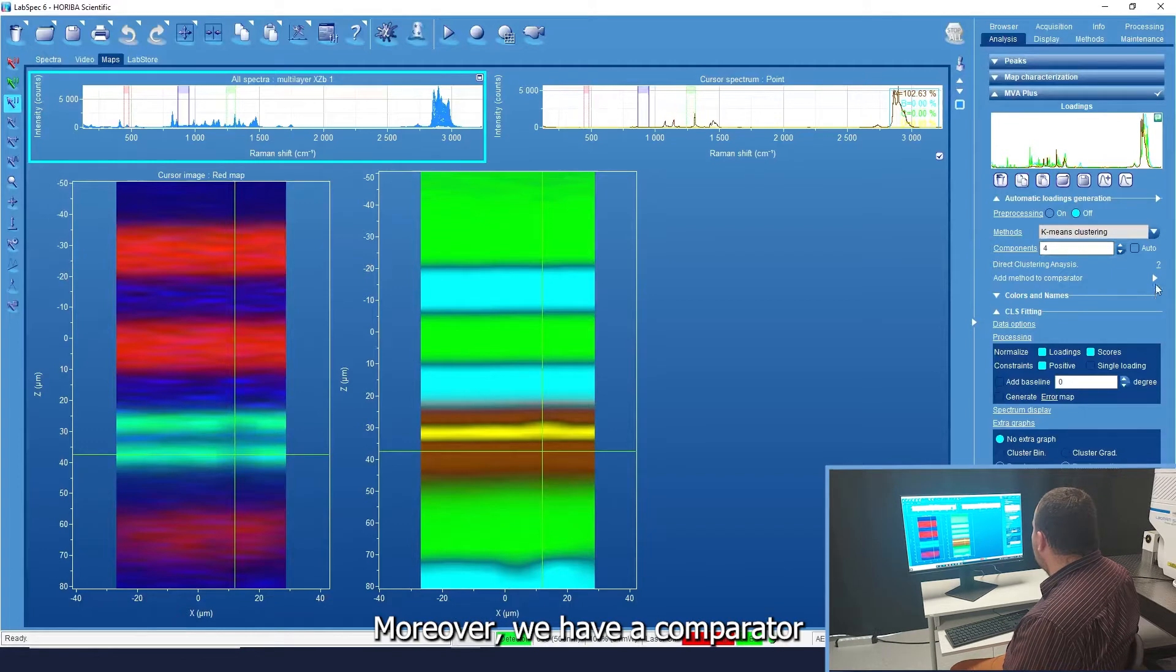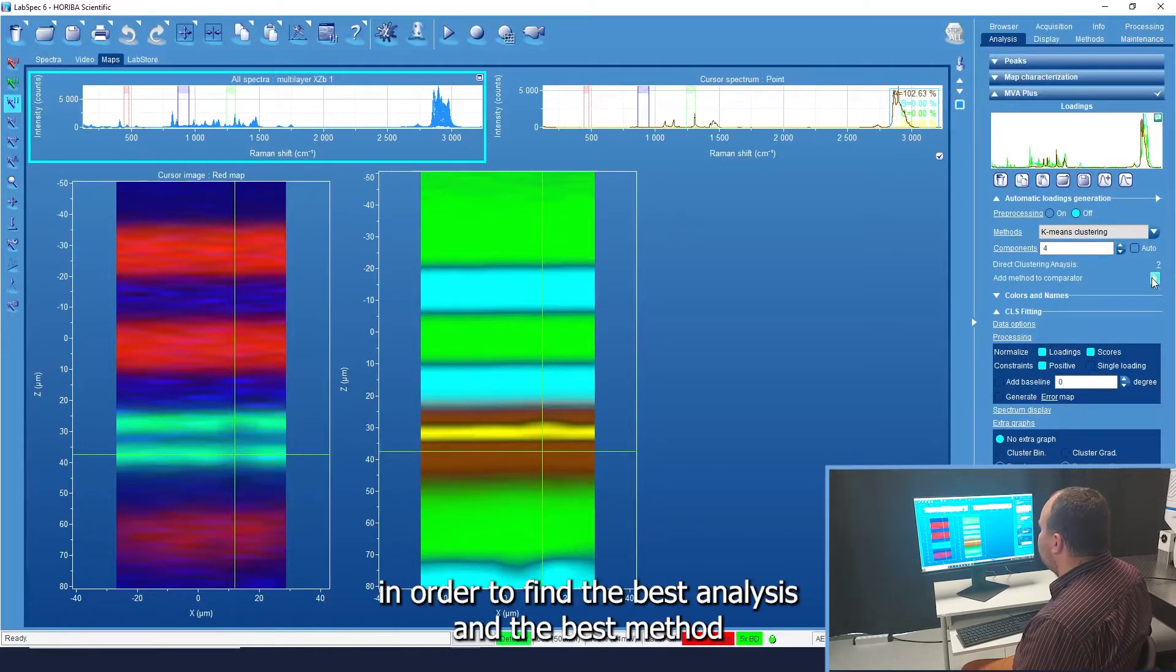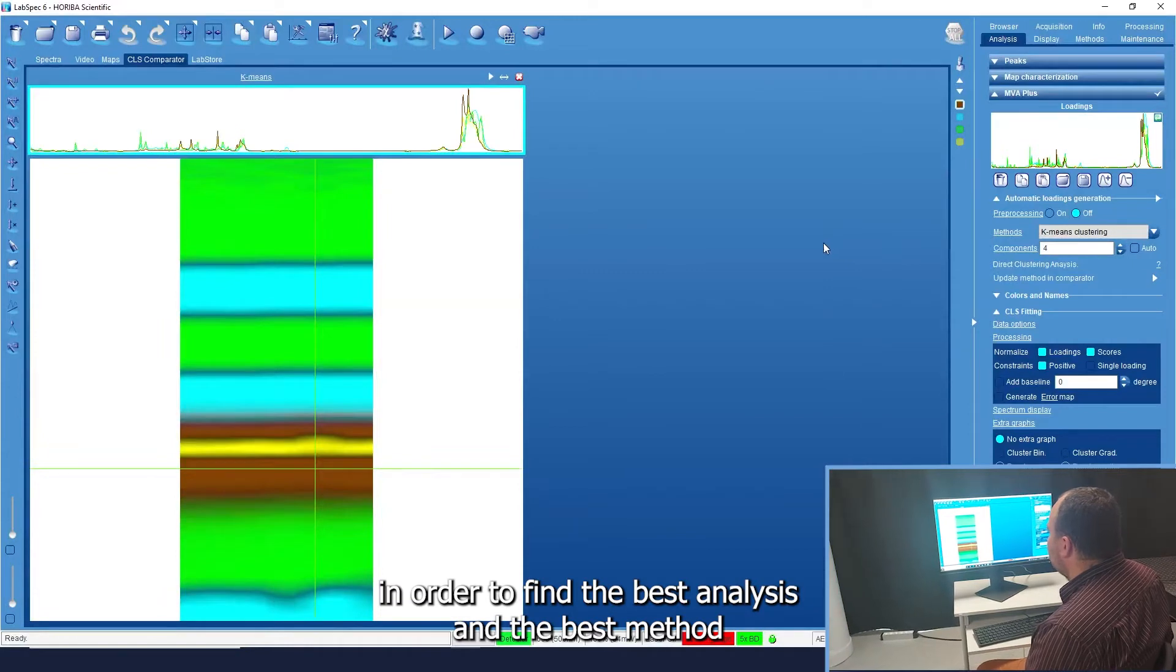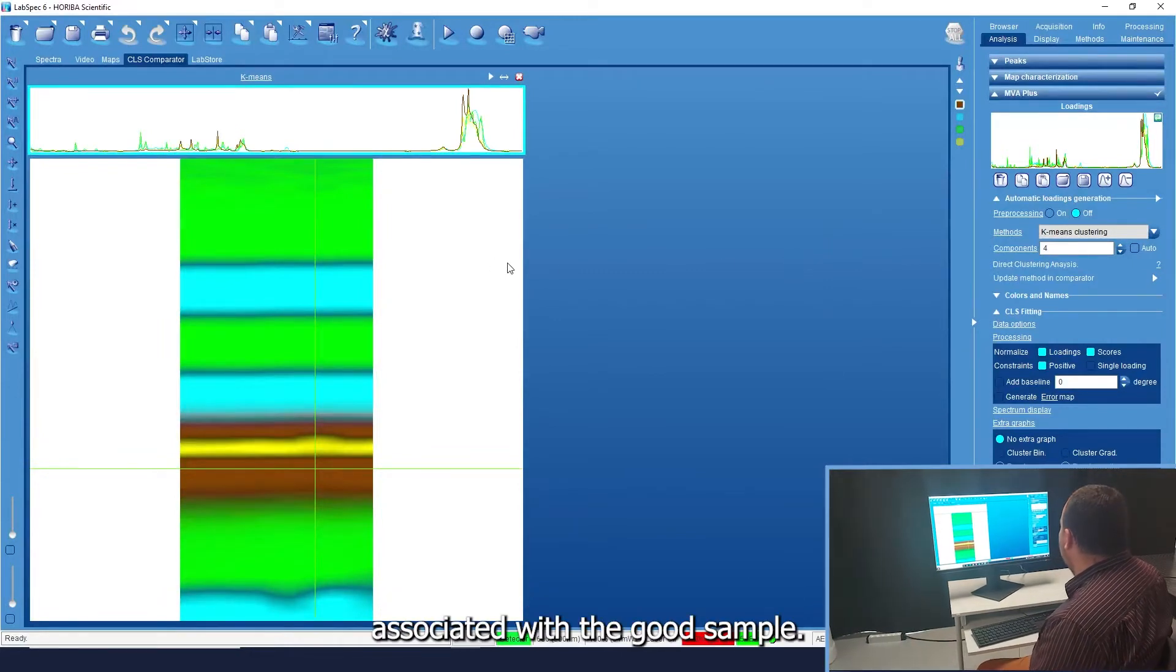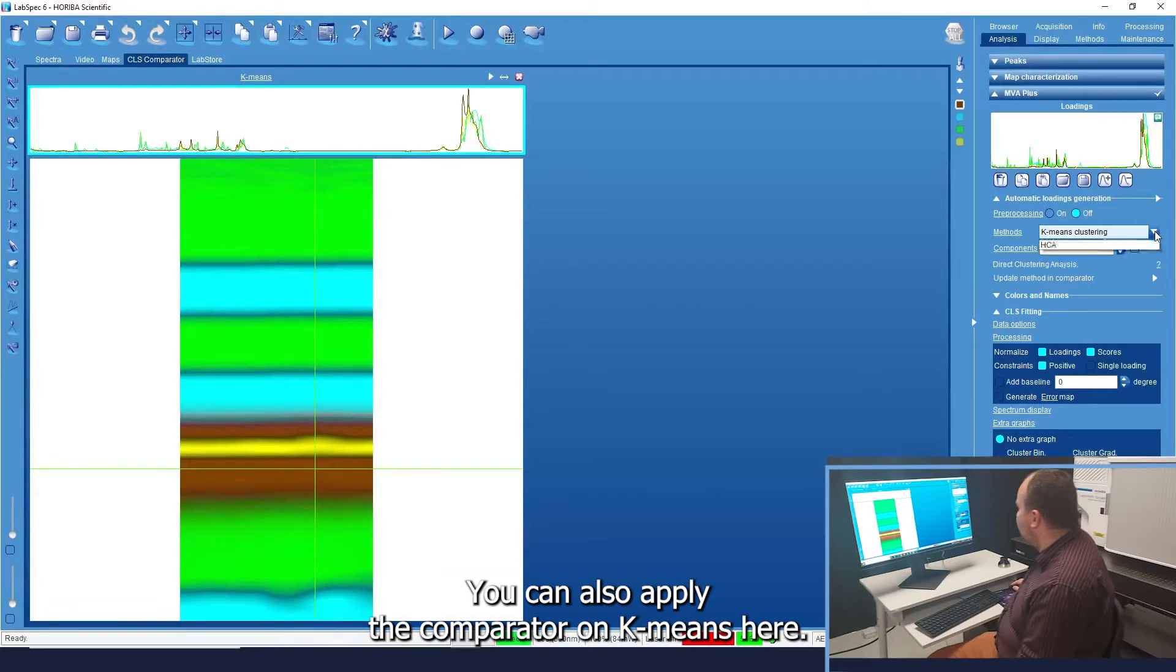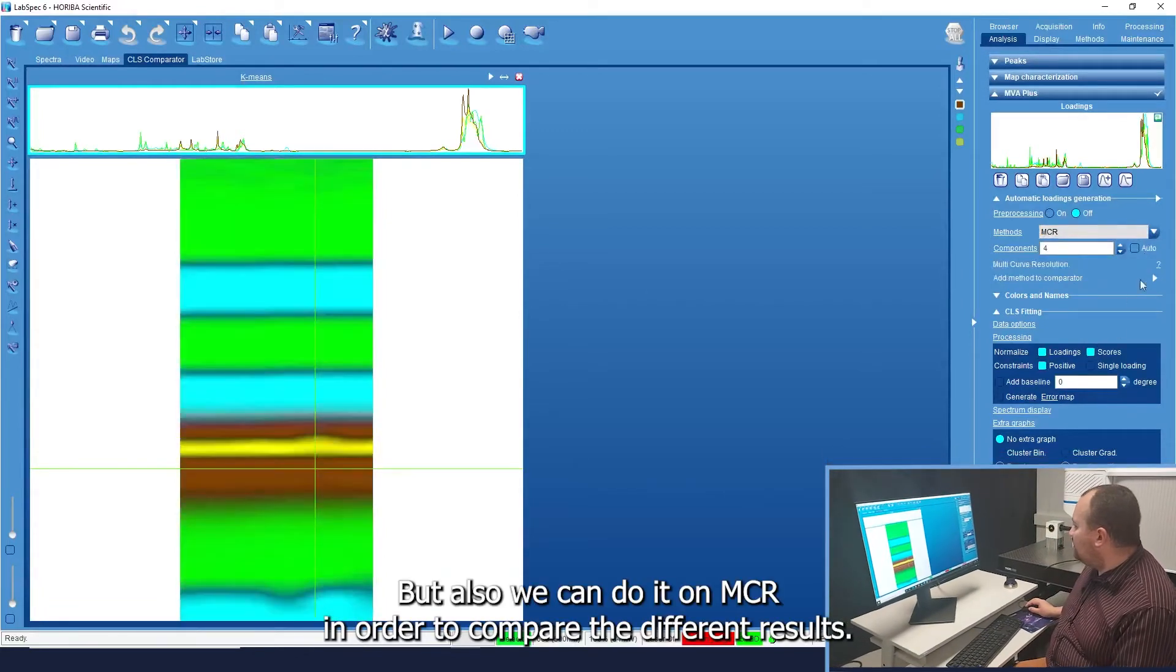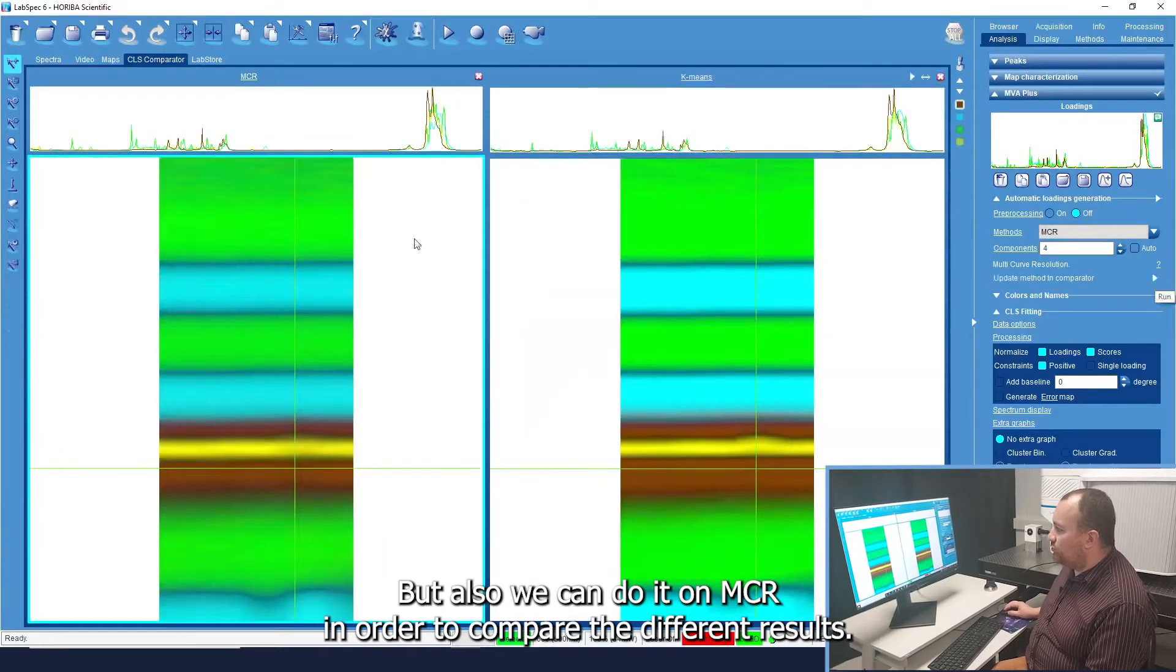Moreover, we have a comparator in order to find the best analysis and the best method associated to the sample. You can apply the comparator on K-Means here, but also we can do it on MCR in order to compare the different results.